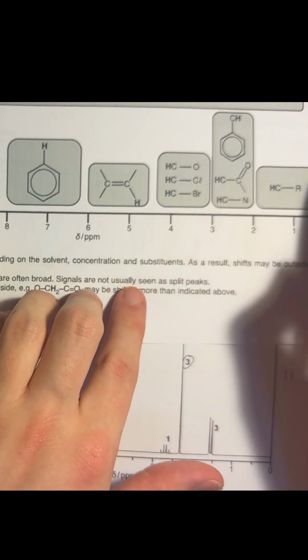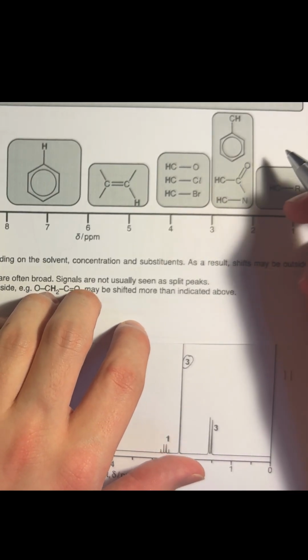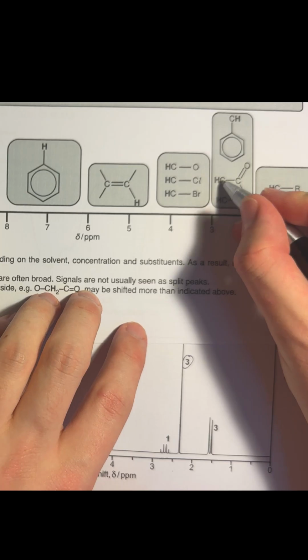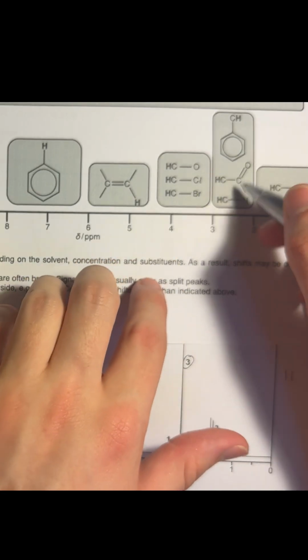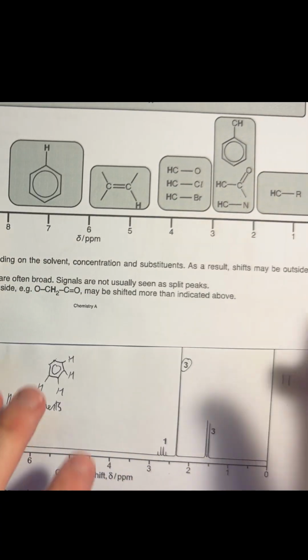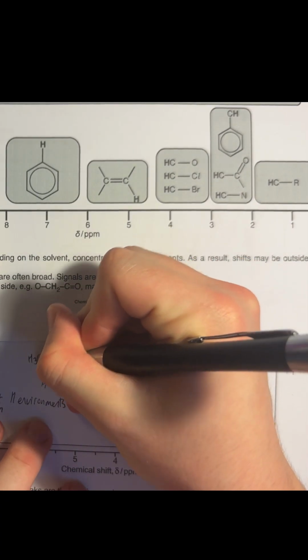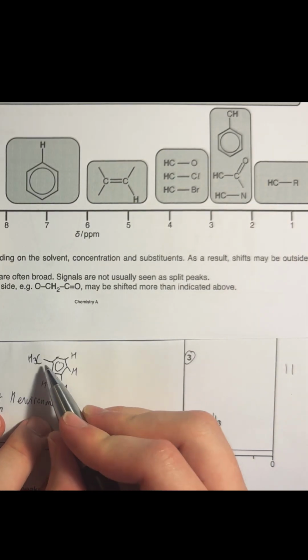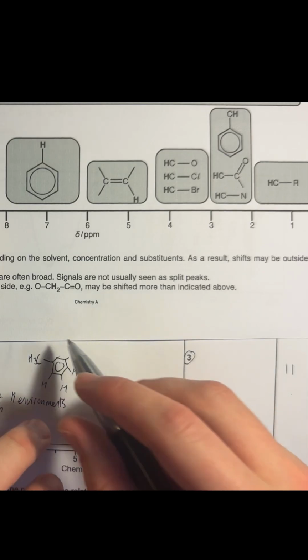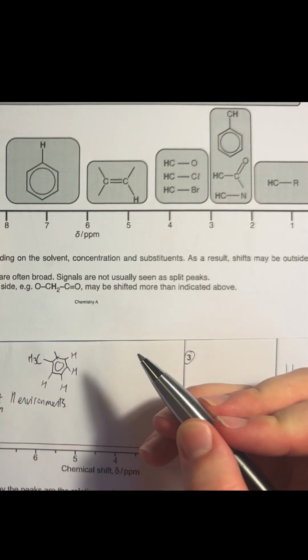There's no room to put an aromatic ring on, because you can't bond it to this oxygen, can't really have 3 bonds, and can't bond it to this H, because it's already bonded to a carbon. This carbon's already got 4 bonds, it just won't work. So it has to be this one. So therefore, currently the structure will look a little something like this. H3C, so a methyl benzene, and then something to do with, on this carbon, a COOH.